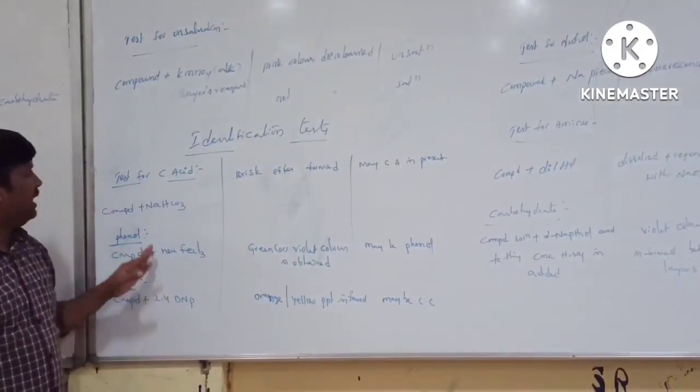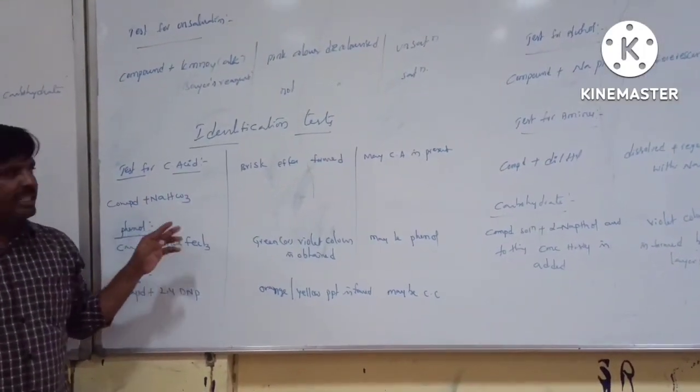Then we go for the identification tests. Test for carboxylic acid identification.